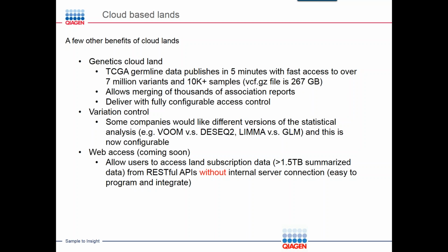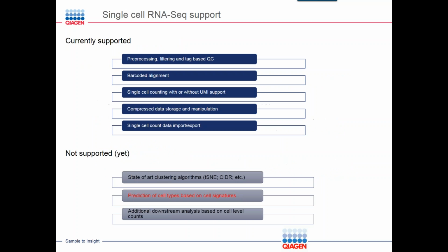So that's really, from the Omicsoft point of view, a lot of you already have some ideas from Gary's webinar, but I want to re-emphasize that this new technology plus the optimization that we did in 10.0 is going to change the user experience for LAN. And this is why I think this is the top feature from the new release.